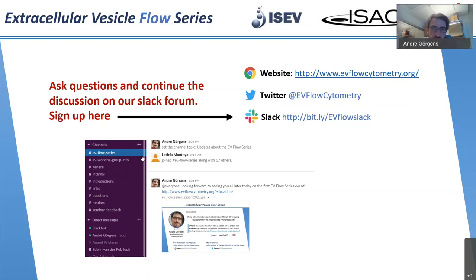We have another question asking if you normalize the results from your multiplex. Actually, we haven't done that much for this. Josh is definitely the expert for that, so maybe he can amend after I briefly answer that. We basically presented mainly raw data, let's say normalized in a way. You can do different things probably in that context. What we have done is the background subtraction, definitely, and these are all the values that I showed. But a normalization that is showing the data in a more meaningful way is something Josh is working on at the moment, so maybe he can catch up on that.